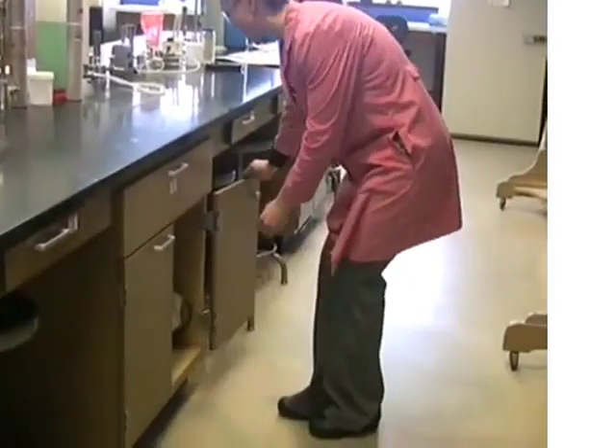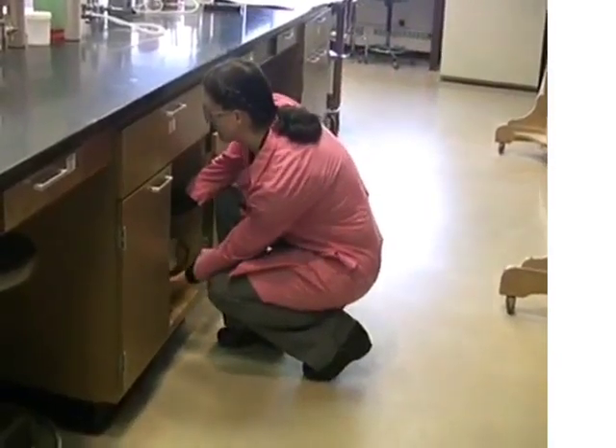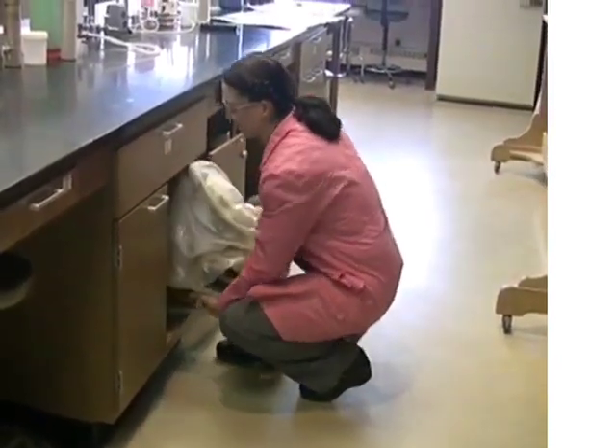Whenever you take your scope out from underneath the bench, make sure to put two hands — one under the base and one on the arm. As you set your microscope onto the bench top, don't slide it around.